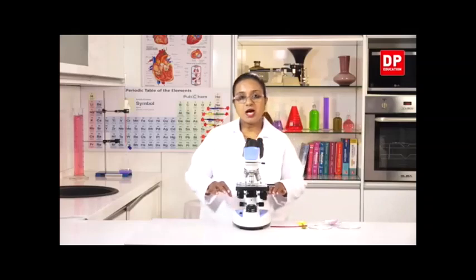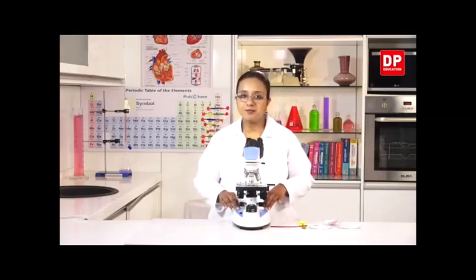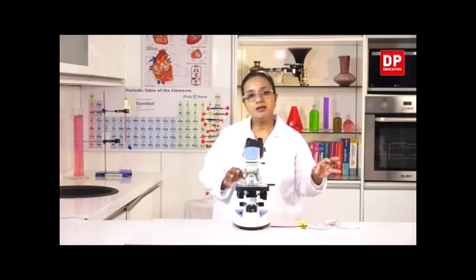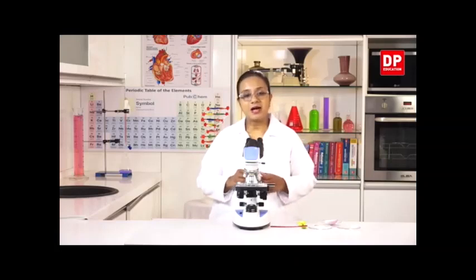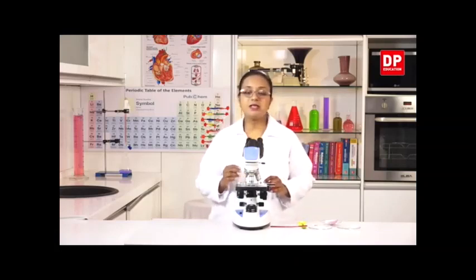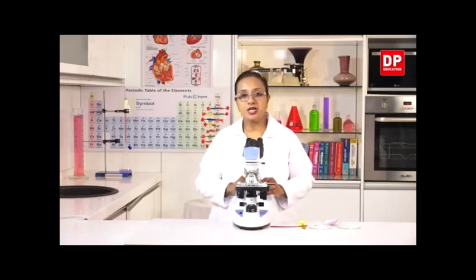Okay students, now that you have observed the two samples clearly, what are the differences you saw between the cheek cell and the plant cell here? The cheek cells were spherical in shape, whereas this specimen, that is the onion peel, has cells which are polygonal and kind of elongated in shape.